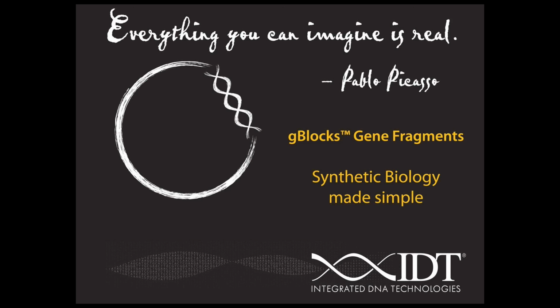Sequences that are below somewhere around 22% GC content, we also really struggle with, and we have problems manufacturing. We also have problems with repeats, and so if the density of repeats becomes very high in certain areas, that can also limit our ability to make gBlocks.